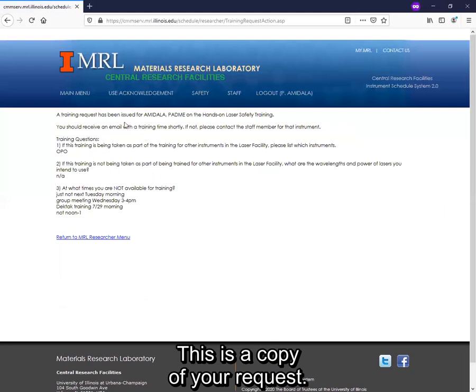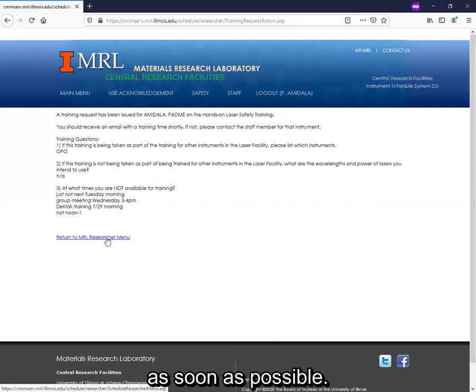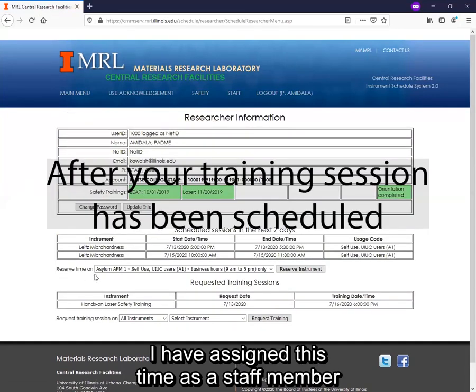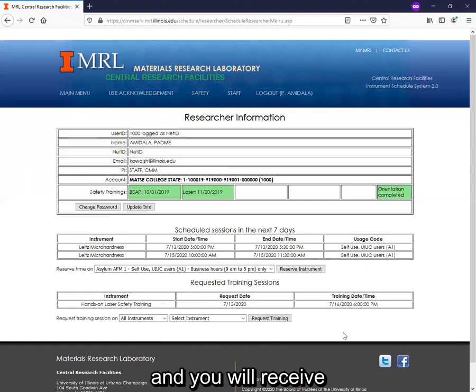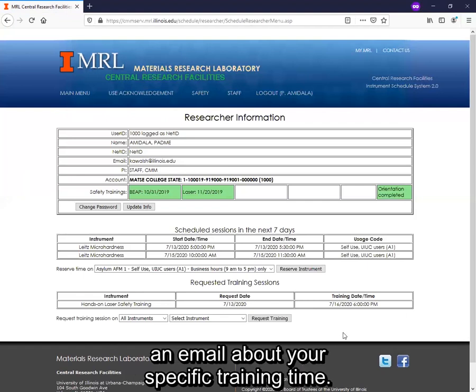This is a copy of your request. You will receive that as an email, and we'll get back to you as soon as possible. I have assigned this time as a staff member, and you will receive an email about your specific training time.